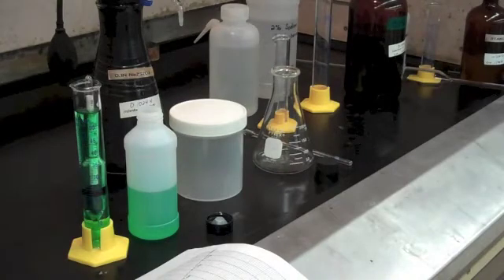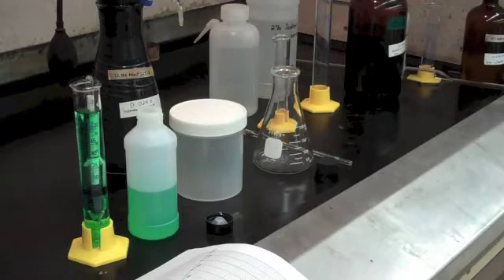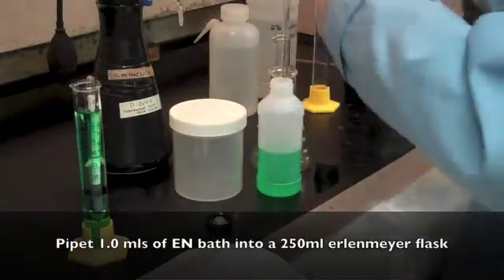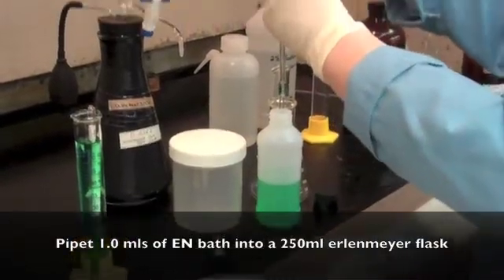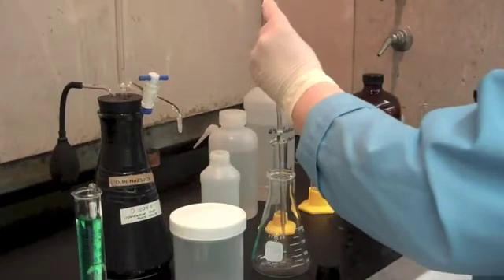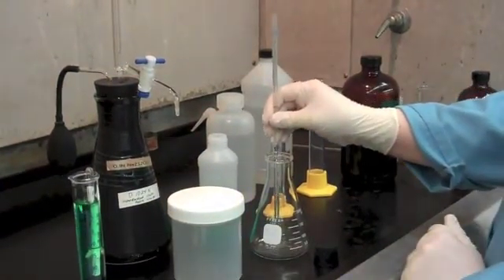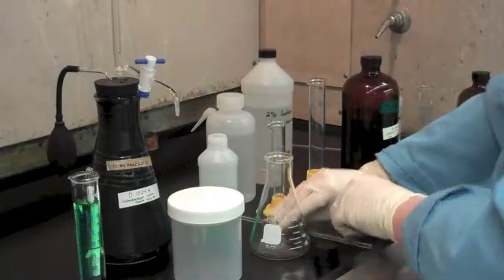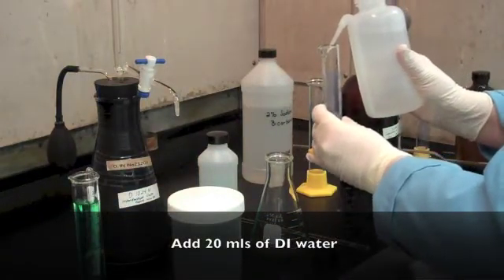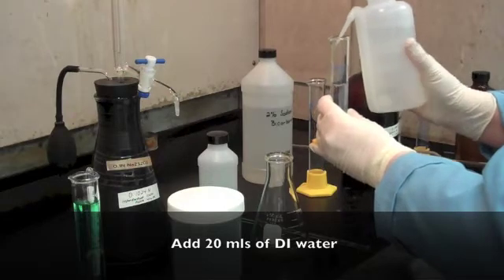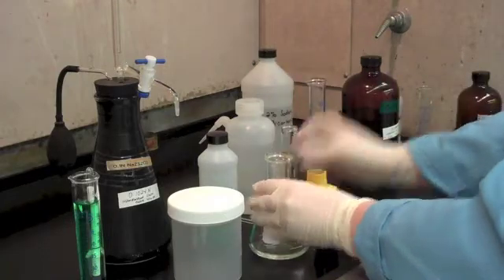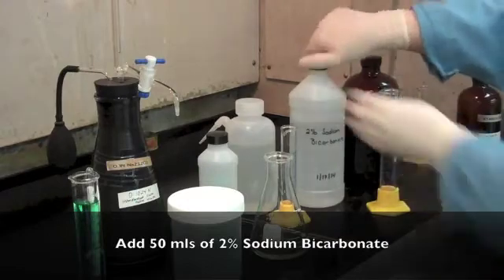Now I'm going to show you how to do the titration method to determine your bath age. We're going to take our bath and pipette 1 milliliter into an Erlenmeyer flask. Then we'll add 20 milliliters of DI water and 50 milliliters of 2% sodium bicarbonate.